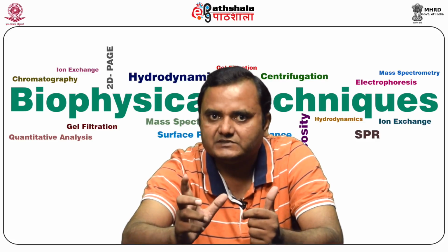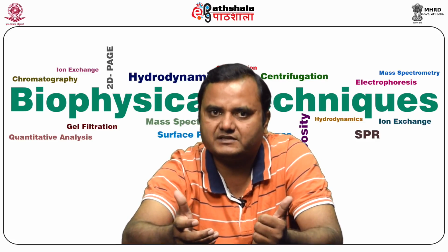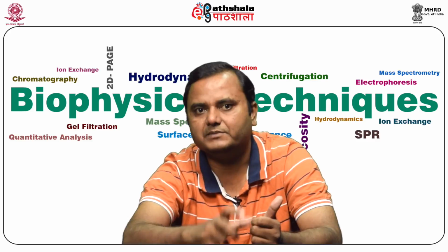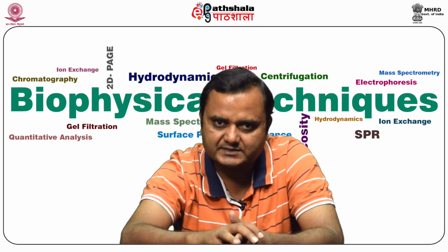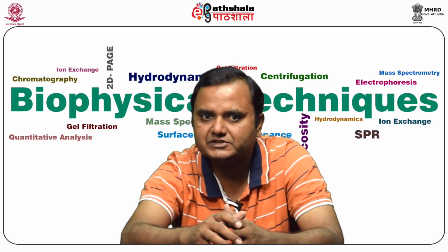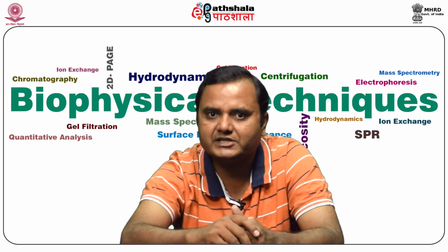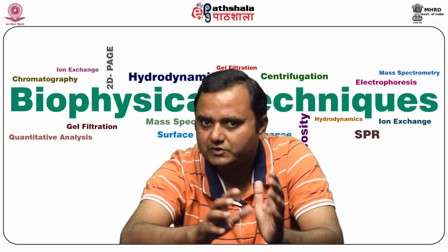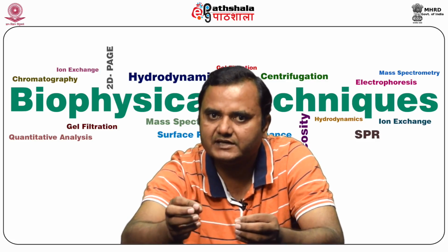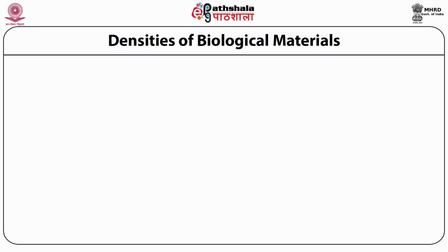In analytical centrifugation, the particle may or may not be utilized further, but in the case of preparative centrifuge, that substance or particle may further be utilized for other purposes. There are many types of preparative centrifugation, such as rate zonal centrifugation, differential centrifugation, and isopycnic centrifugation. We are going to discuss all these types of centrifugation, their applications, advantages and disadvantages in detail in this module. We are also going to discuss the densities of different biological materials, because in differential centrifugation the density is the important factor.